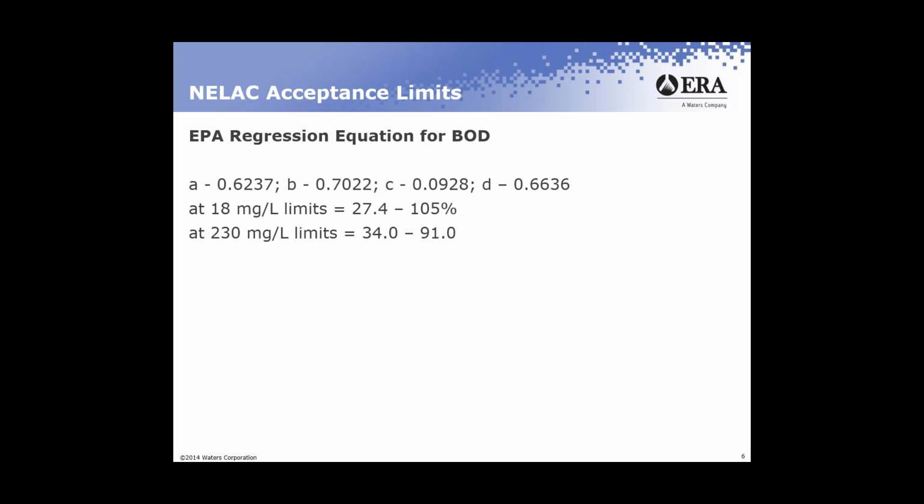And then our D factor is a concentration dependence factor for the variability in the concentration that we're going to spike it at. So if we're expecting roughly 9% standard deviation, the acceptance limits will be plus or minus 3 times that value, or roughly 27 to say 30%. So you're going to be statistically evaluated on about 62% recovery with about plus or minus 30% standard deviation in that.